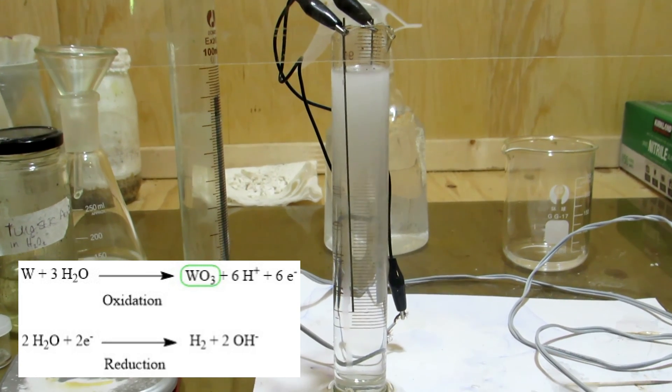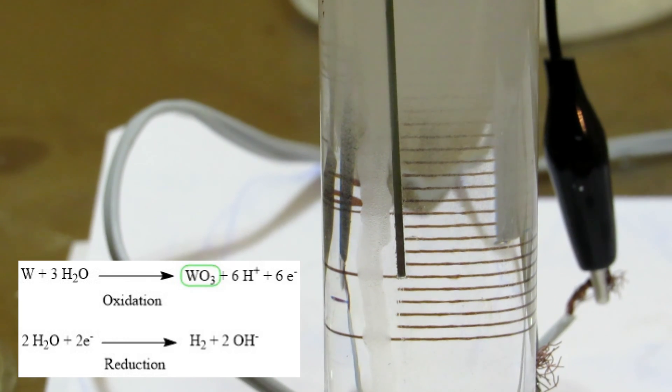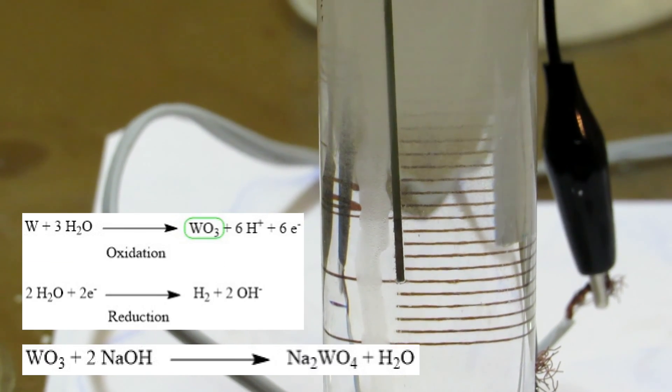The vigorous bubbling at the negative electrode is hydrogen gas, while the density different lines seen at the positive electrode are from sodium tungstate forming and diffusing away from the electrode.